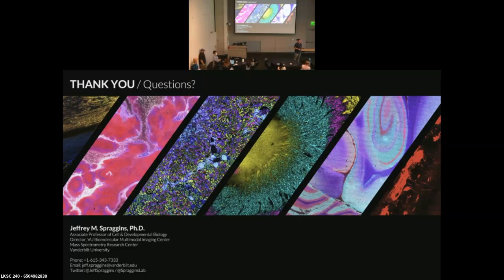Yeah, very impressive. I was wondering, coming from a regular mass spec to this kind of mass spec, whether you had to make a new library in order to identify each of your metabolites and lipids, and whether the retention times and the masses change when you do this compared to just putting a sample in a MSMS. Or... Yeah. So the masses don't change, right? The mass is the mass. So that part doesn't change.